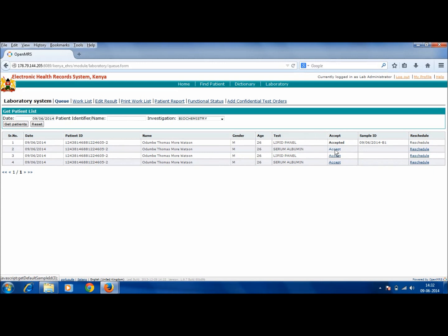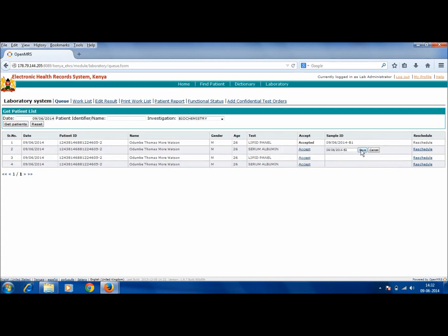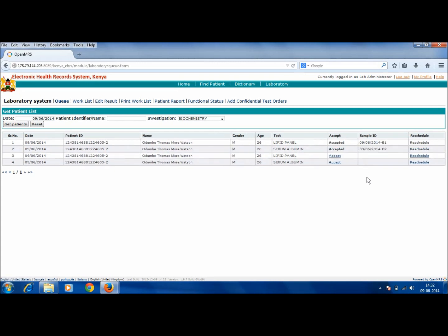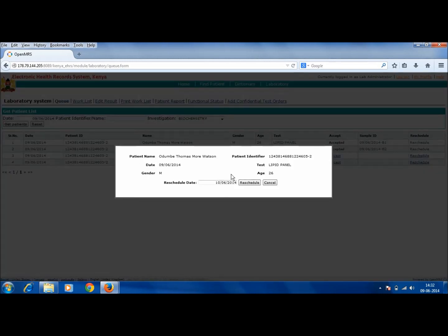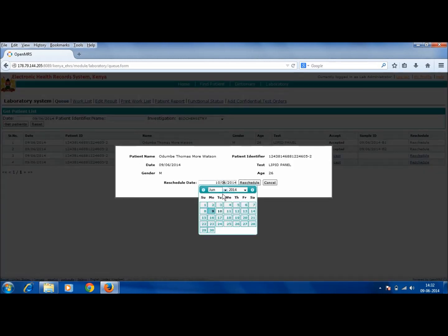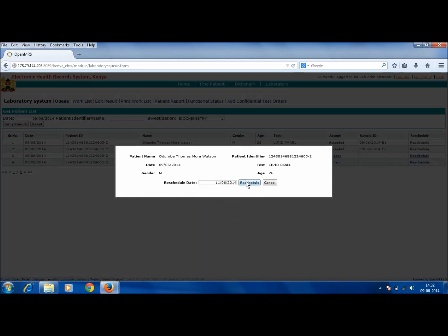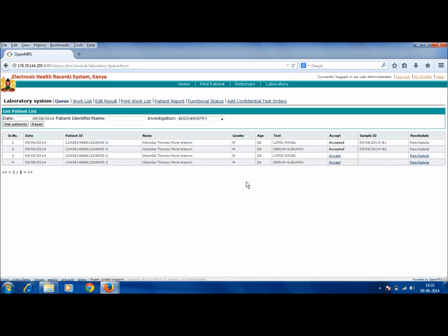The similar process has to be done for all the tests of our patient. Also, if you want to reschedule the test for a future date, it can be done by clicking on Reschedule. Here, a reschedule date must be given, say for two days later, and Reschedule must be clicked. On clicking Reschedule, the test will disappear from this list and will start to appear in the list of the day to which the test has been scheduled to.